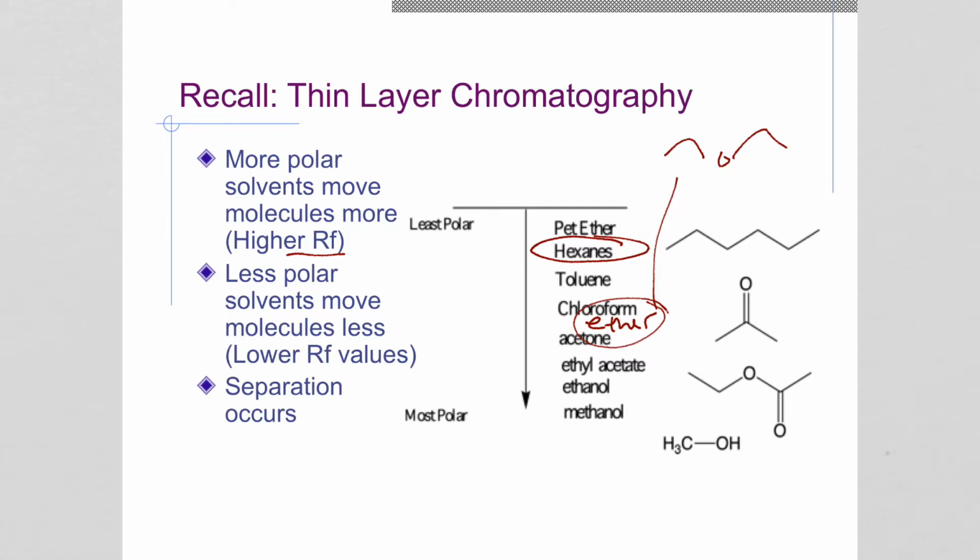It's very common in TLC, as you've seen, and in other applications, to use a mixture of nonpolar and polar solvents. One of the most common mixtures is hexanes along with ethyl acetate, which is pictured here. But the ether is nice because it's very volatile and easy to get rid of.